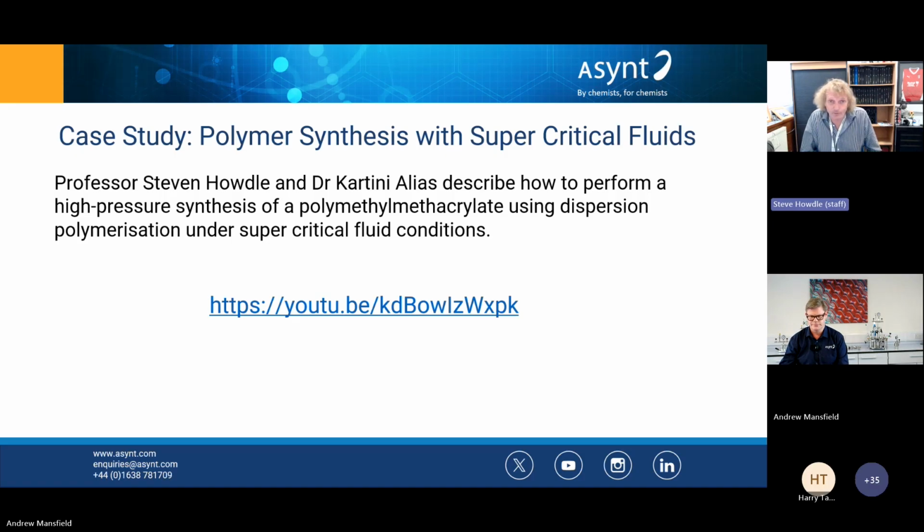And that's something you really want to avoid. So you should always check very carefully the size of the room, the ventilation of the room, and how much CO2 you're going to be potentially putting in there if your vessel vented very quickly. That's a really big safety aspect that we take very seriously.